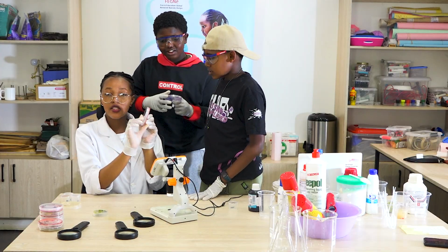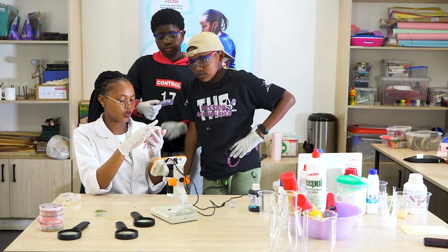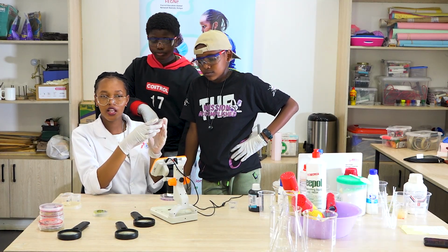So from that, we've started using our eyes, and then we can visualize them under the microscope and see how these colonies look.